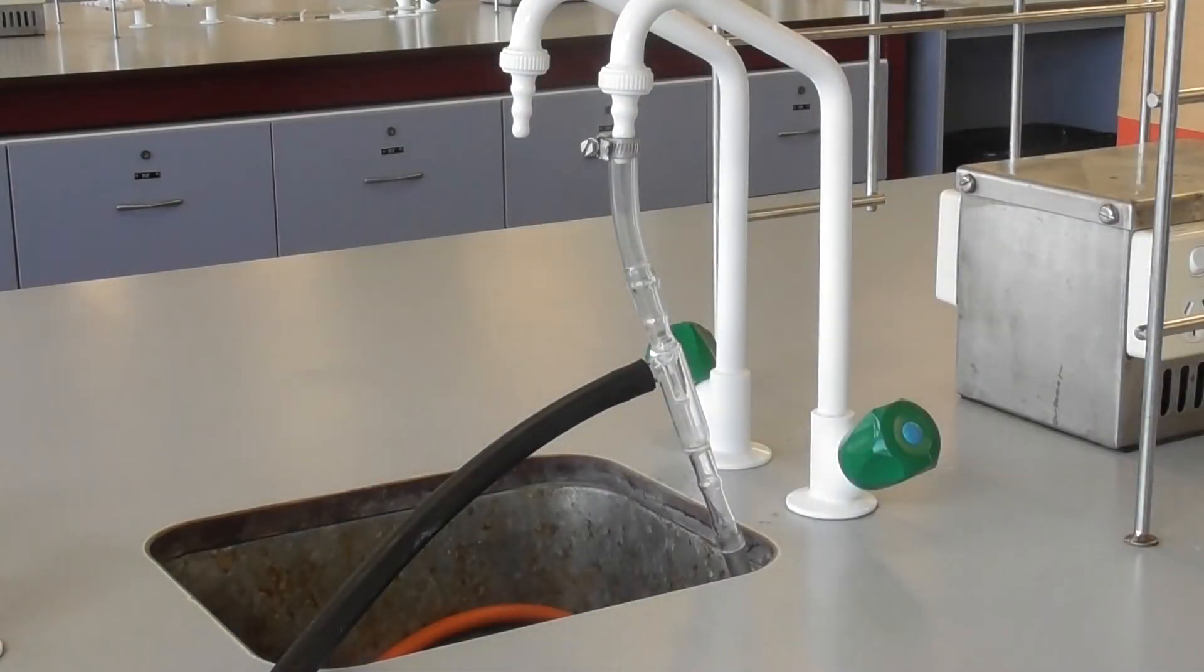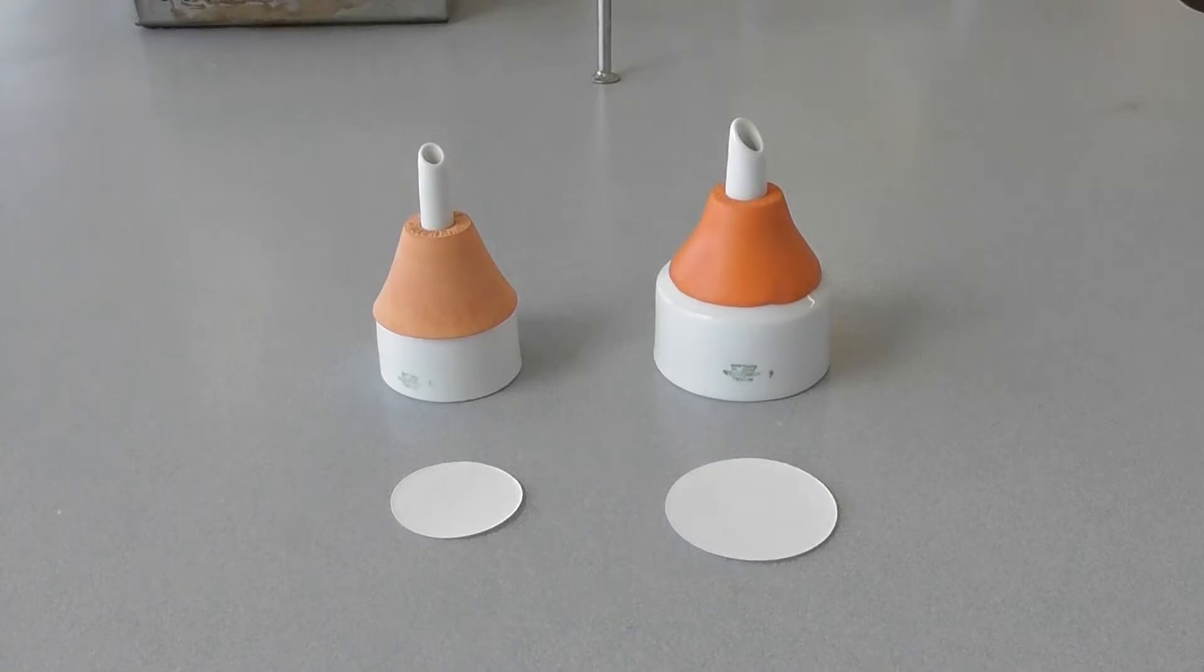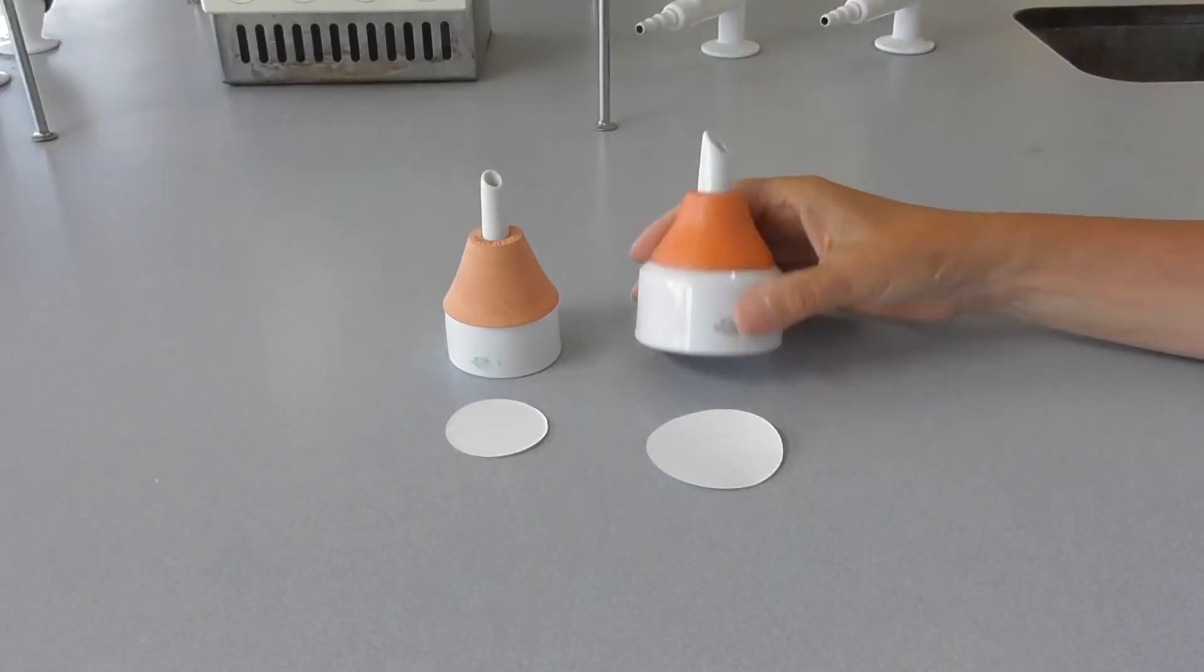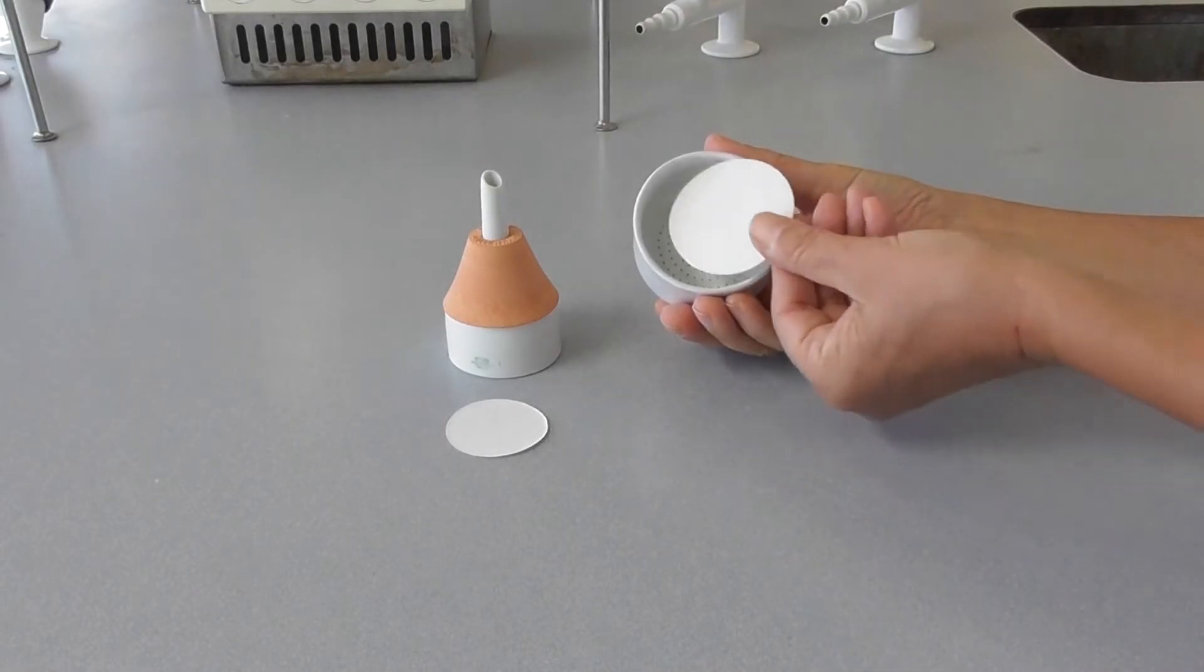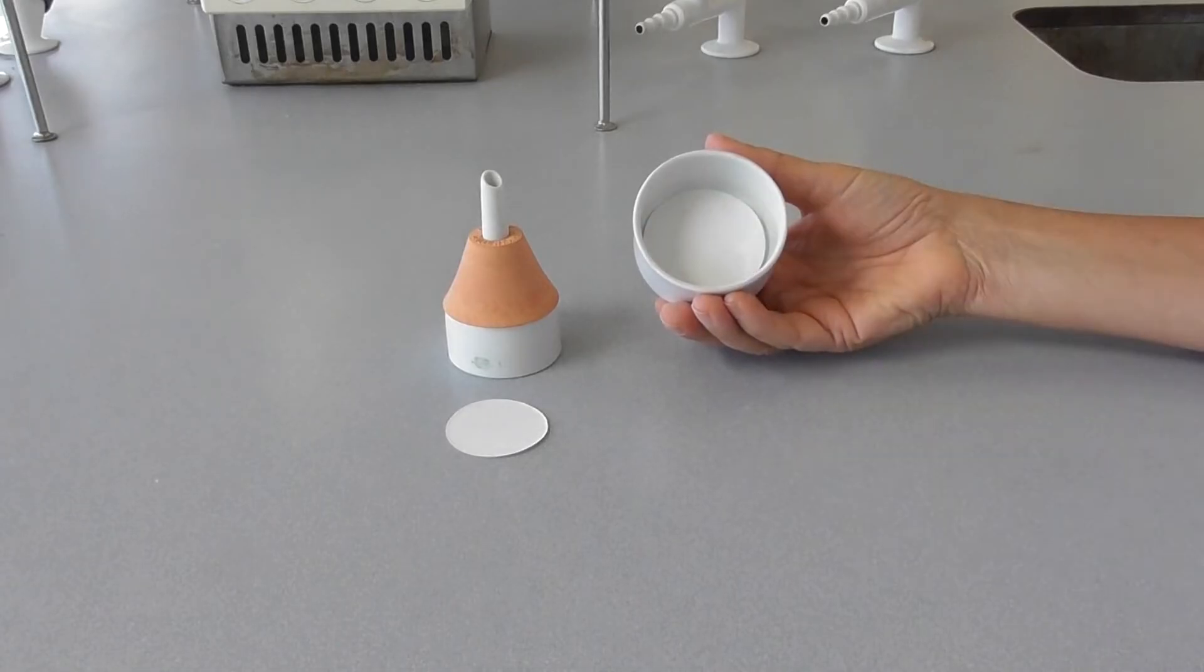To carry out the vacuum filtration you will also need a Büchner funnel and filter paper. As the Büchner funnels come in different sizes you must check that you are using the right size of filter paper for your funnel. The filter paper should fit snugly on the bottom of the funnel covering all of the holes.